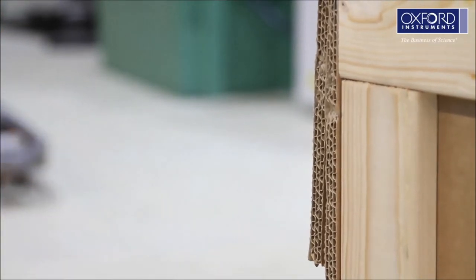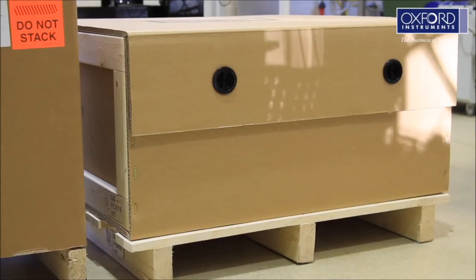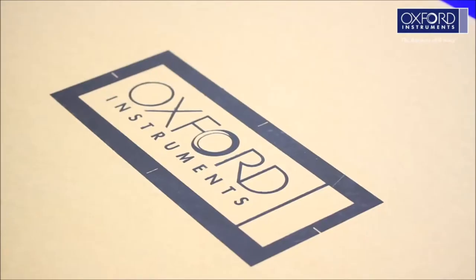When your system arrives, it will be in two main packages, each on a wooden pallet. Please check to ensure there is no damage. If there is anything wrong, please let us know.